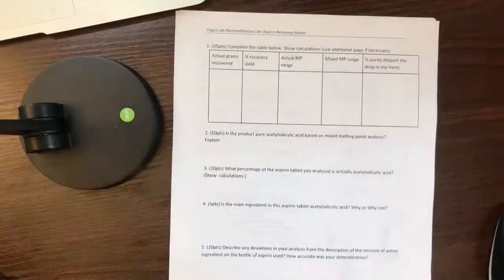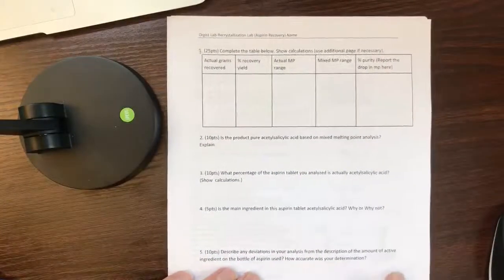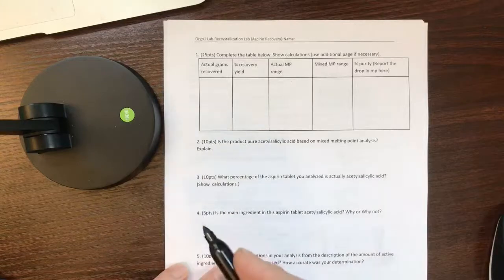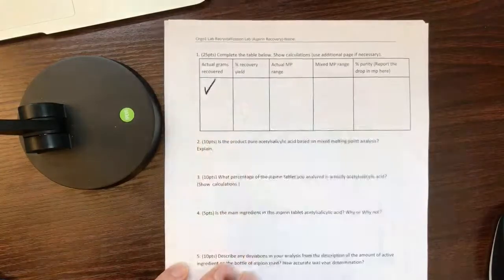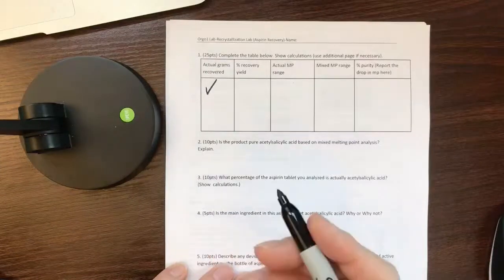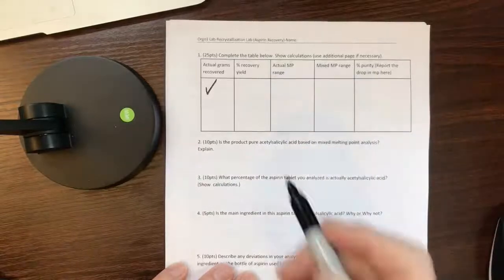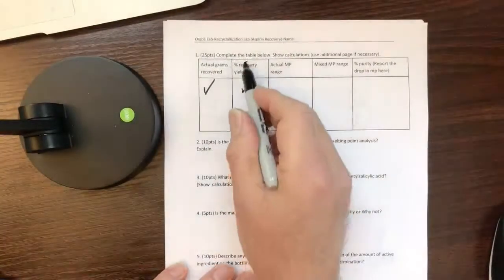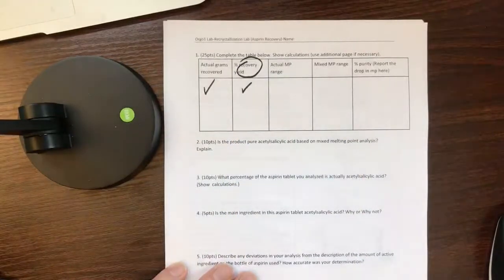Then after that, we're going to look at what we actually did in the lab. Based on the procedure, we get some grams out, and we know how much actual aspirin is in each tablet, which is on the jar or the bottle. So we're going to calculate that. That's what we call recovery. So that's my recovery.